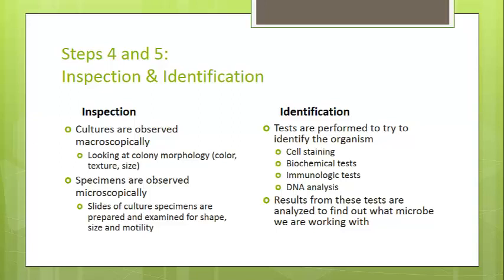And of course, this usually takes doing a few types of tests. We don't just do one type of test and we know for sure. So we have to do some cell staining, growing up some different types of media, differential media, selective media. So identification can be a little bit more time consuming than the other steps.